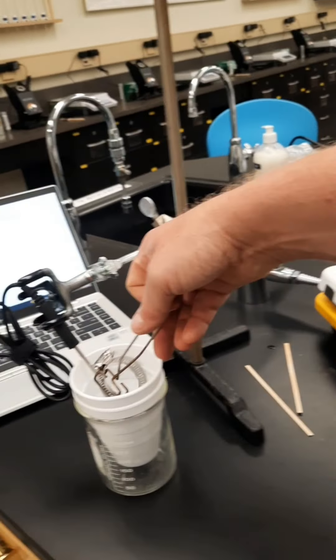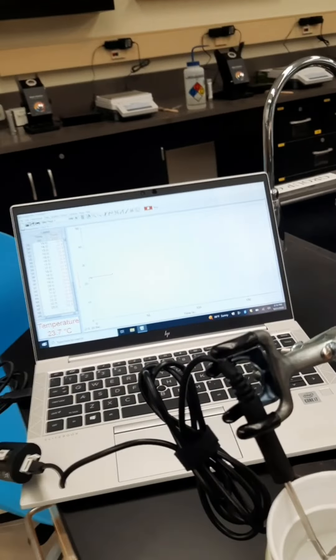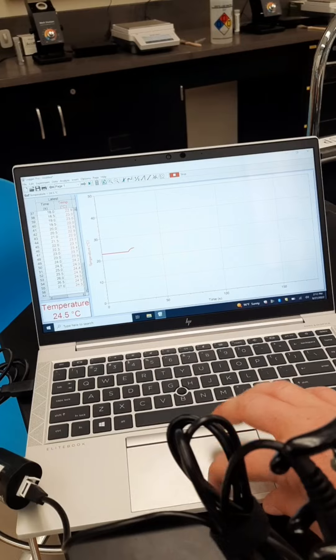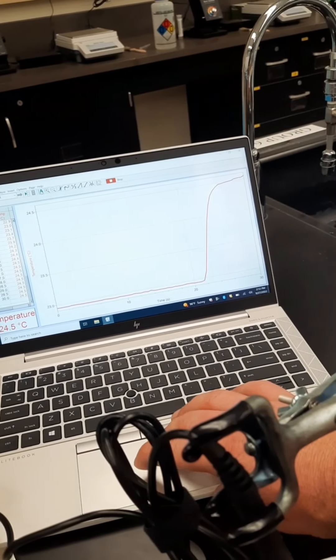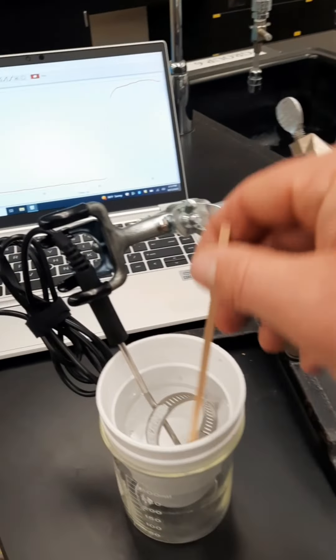Putting it in here. We see the temperature immediately rise and it's going up. Give it a little stir.